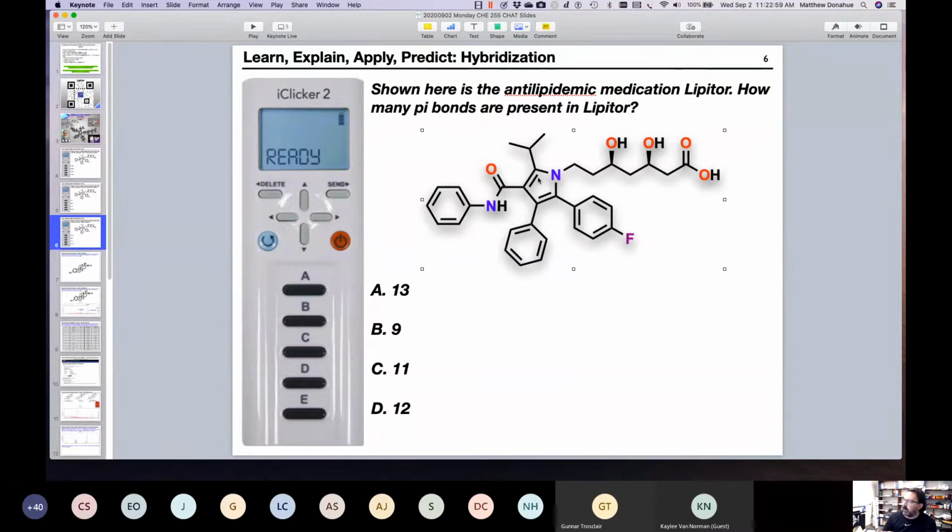You are observing with your eyeballs this structure on the screen. So we can do these exercises. But what if you were given a substance, a white powder, and then you were given pieces of data, and you had to look at the data, put it all together, and elucidate, that's what that word means, elucidate the structure?